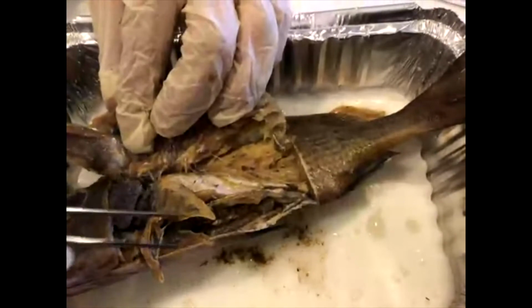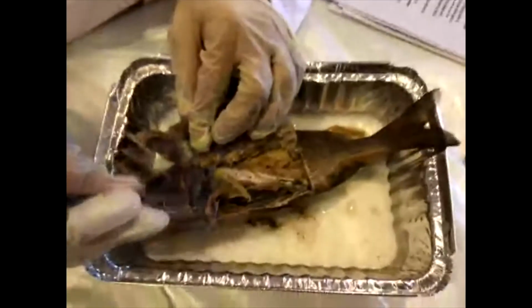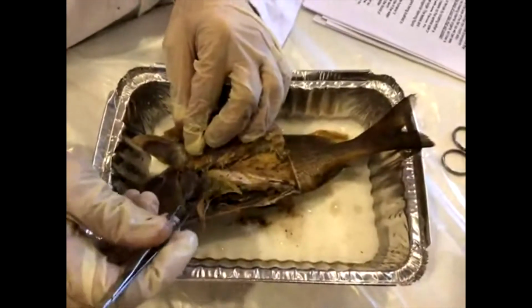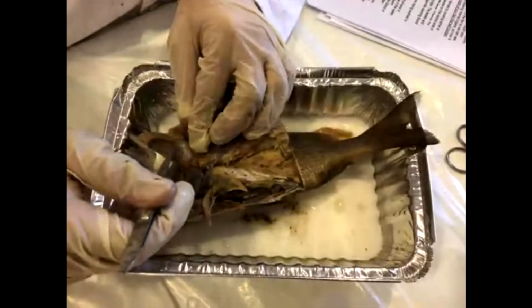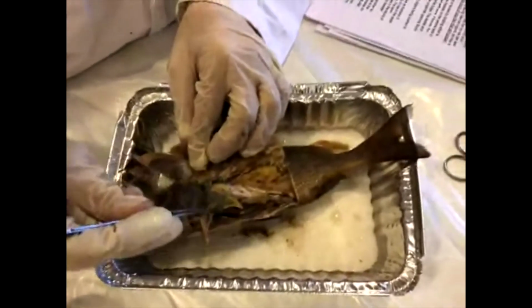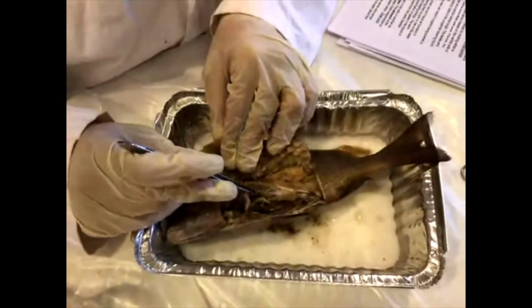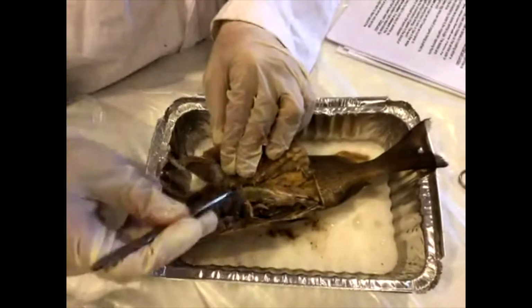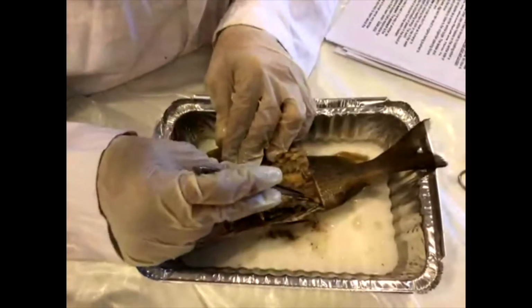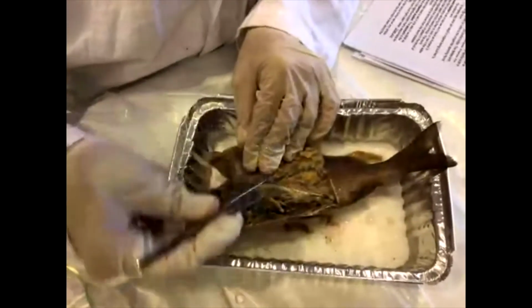It helps produce enzymes that break down food. It reduces toxins from the body, so it's working overtime all the time to make sure that the fish is getting the nutrients it needs and getting rid of the things that it doesn't need. So you can draw your liver, maybe overlapping your swim bladder a little bit up like this. And I would recommend labeling it, because if we're not writing the name of the different organs down, we might lose track of what we're drawing really quickly.